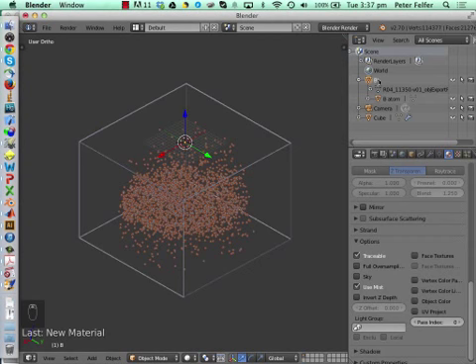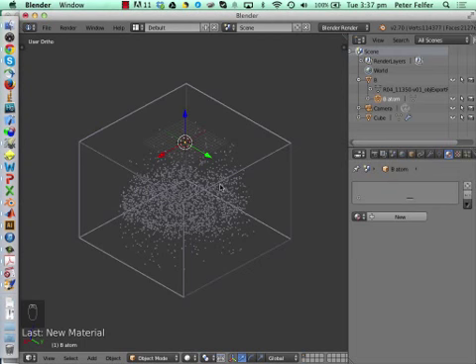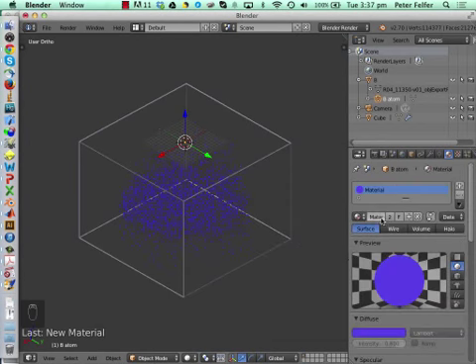Oh, yeah, sorry, I gave the material to the boron and not the boron atom, of course. My bad. So now we made the boron the parent mesh with the material, but of course it doesn't make any sense. So if you just click here, you'll have a list of the materials, and we'll just click that one. We'll rename it boron material. So in case you had multiple datasets with boron, you just reuse it.